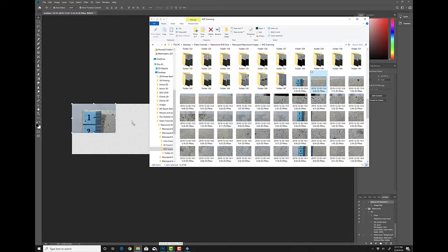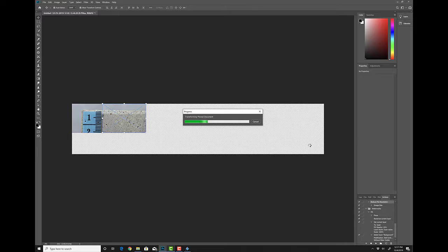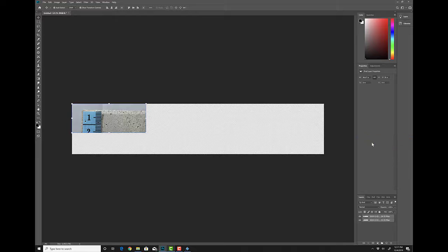Yep. And we'll take our second. Basically, you'll just overlay it right there. And you'll keep doing that until the entire core sample is built out. And once you have all images, so all 20 by 6 photographs, you'll go back to layers. You want to click on them. You want to rasterize those layers.